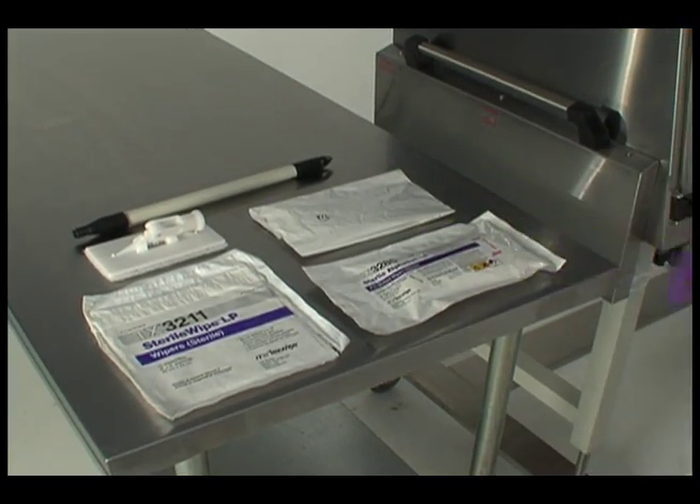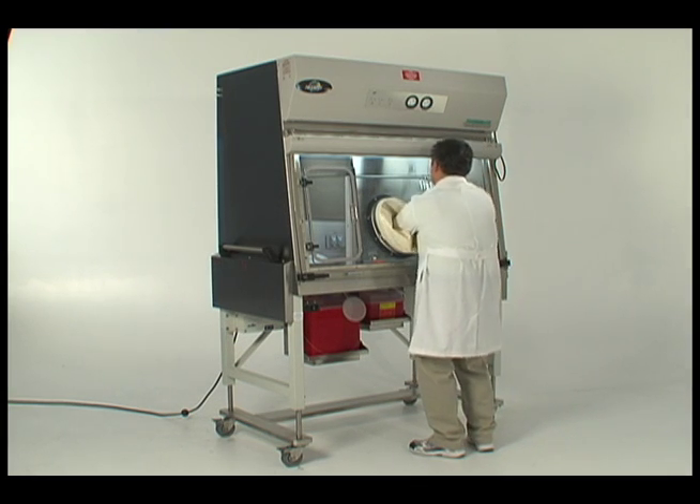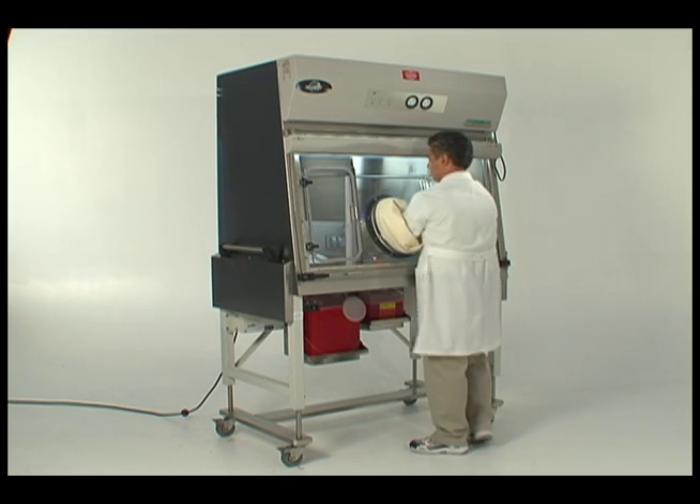The following steps are recommended; however, your facility's supervisor will ultimately determine the cleaning and disinfecting steps and agents required to properly clean the isolator.